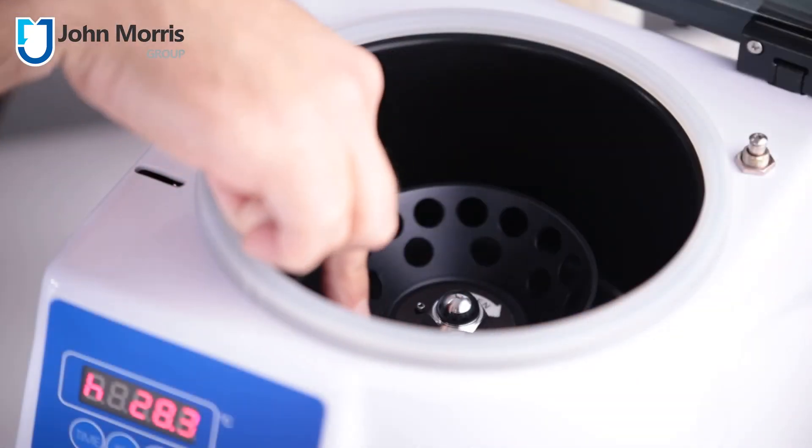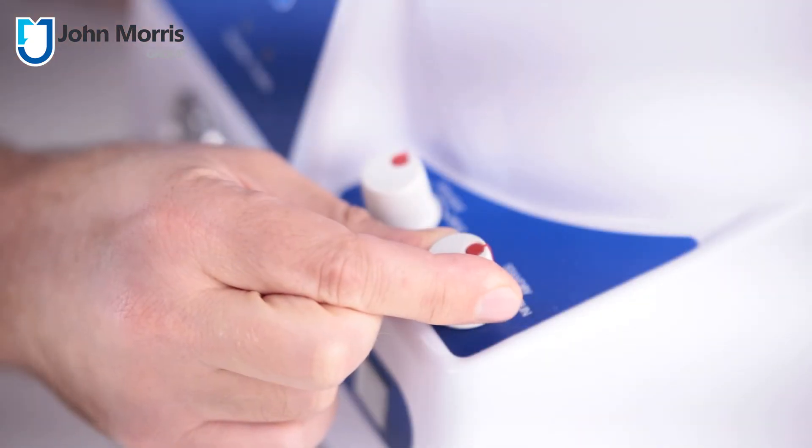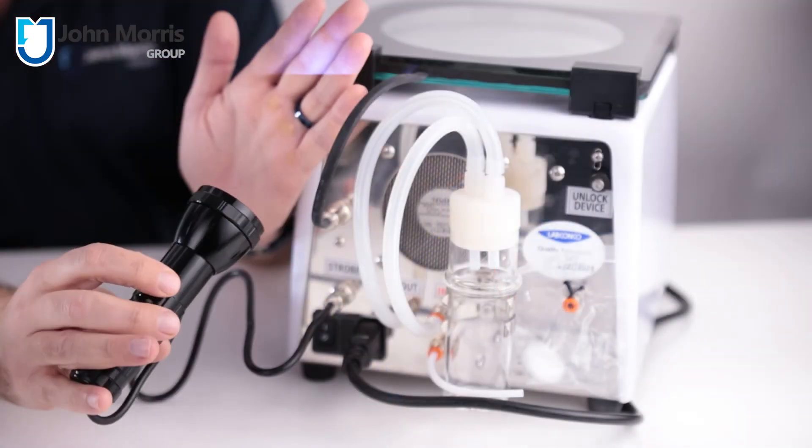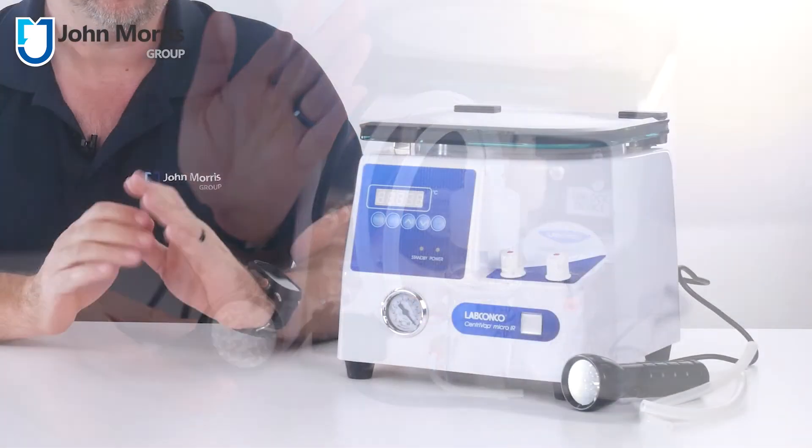So there you have it — the complete, economical and easy-to-use Centrivap Micro-IR from LabConco. If you need to concentrate a small number of samples in a limited space, we believe you might just have found your solution. Don't forget, John Morris is here to help you with science-based technology. Thanks so much for watching and bye for now.